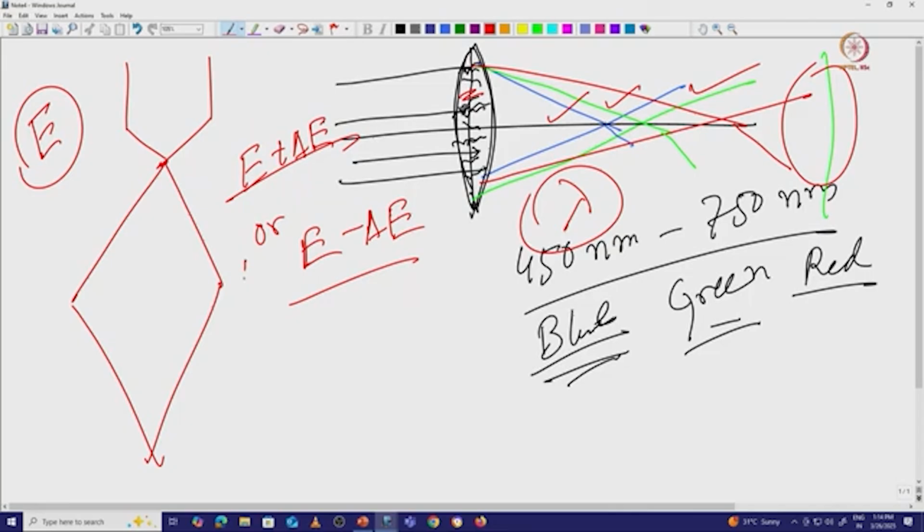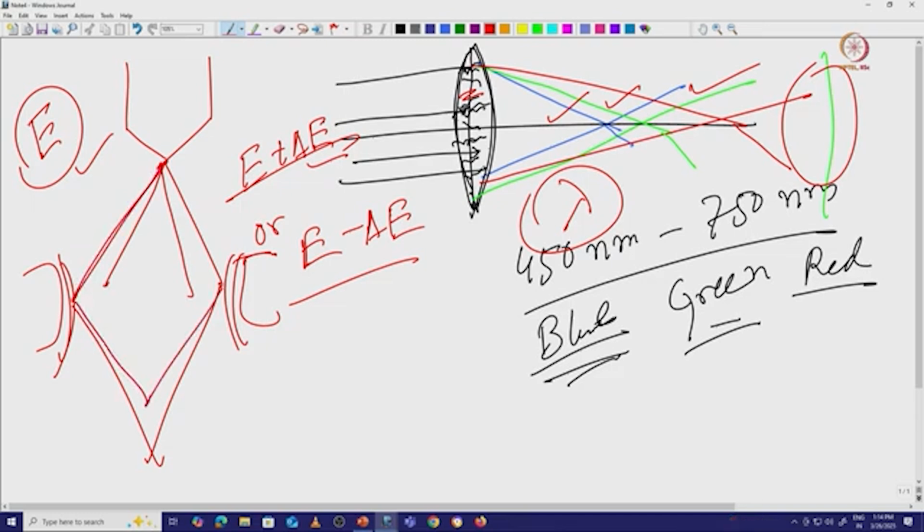Because here we are using a fixed magnetic field, if the energy of the incoming electron is not fixed, then the electron can merge in a different plane. So it will not go all the way here, it will merge somewhere here or somewhere here. Energy is directly connected with your wavelength, and that is going to show when you do the imaging using the electron microscope.